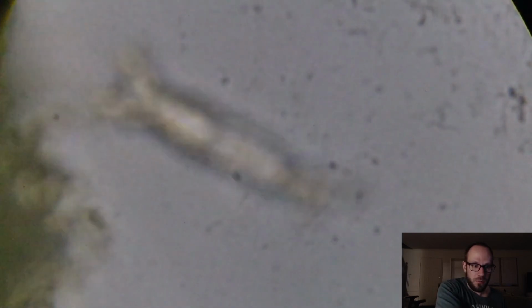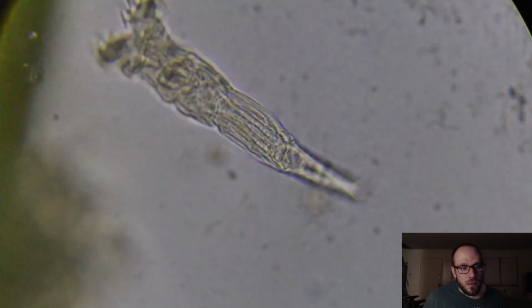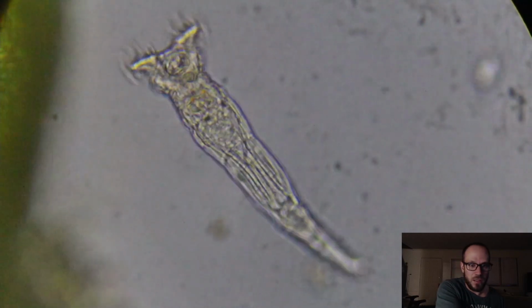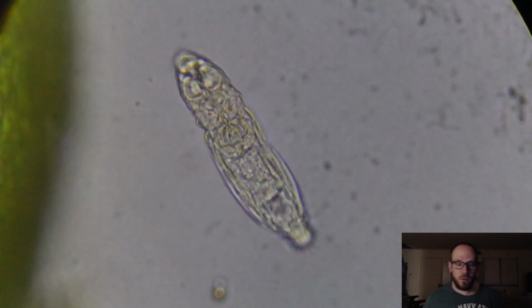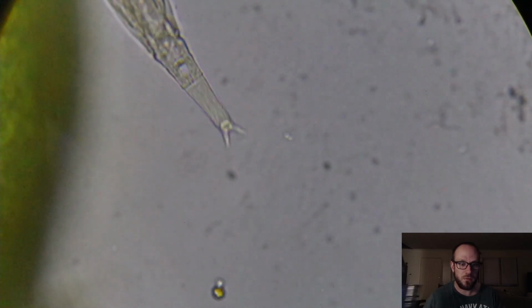These guys are part of the decomposition process and have existed for probably billions of years. I don't know about billions, but many millions at least. And can be found all over the world. They are a true cosmopolitan organism. There's his foot, which he can glue to the ground and remove at his will. All right, let's get back up. Let's see what else we got here.